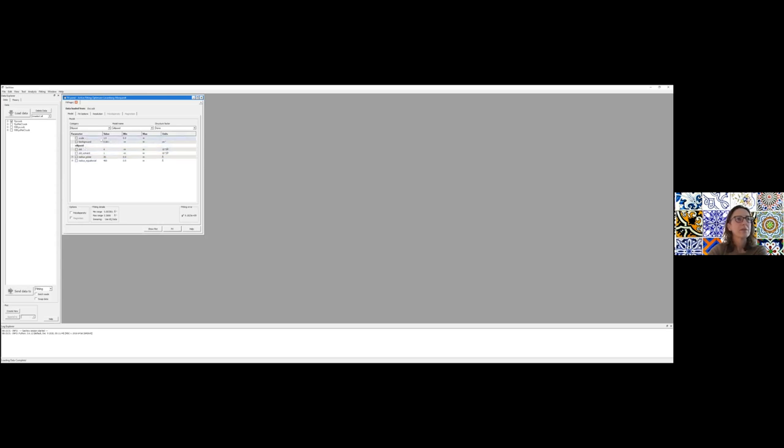So for scale, it's the volume fraction. Our solution is 1 mg/mL. So that corresponds to a volume fraction of 0.1%, right? So it's 0.001. So watch out for the units. The units are here in this last column. The value of the parameter is in this one, and then you have a minimum and a maximum. So if you have a range where you expect the parameter to fall, you can also introduce that here. Otherwise, you just leave it as default if you really don't know.